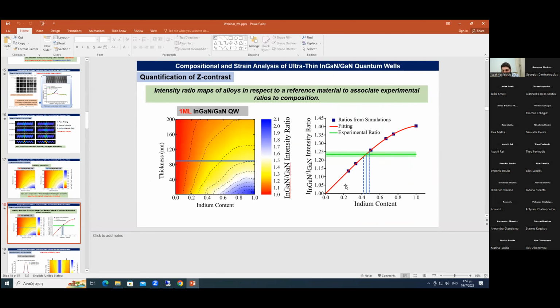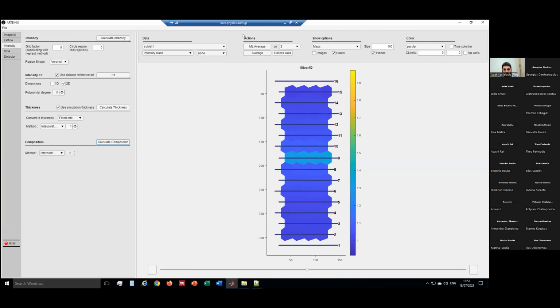So all this database is important to create these maps. And the last tab I used tried to connect the data with different compositions and find this red line. Actually, this is the procedure. If we find this behavior for its thickness, then we are able to find the composition in its Voronoi cell. Let's wait. We have to wait a little bit.